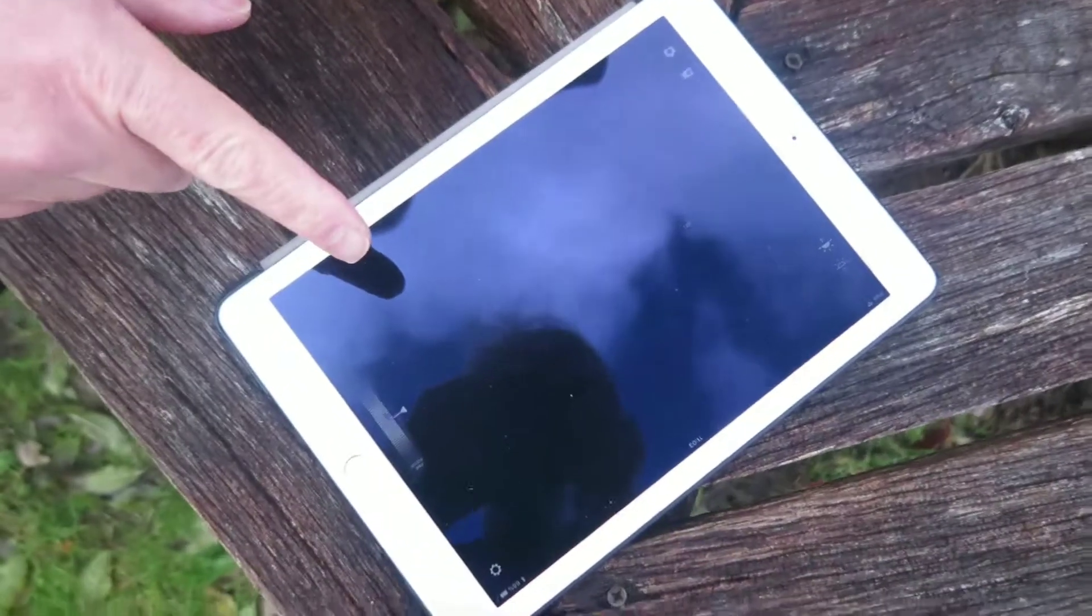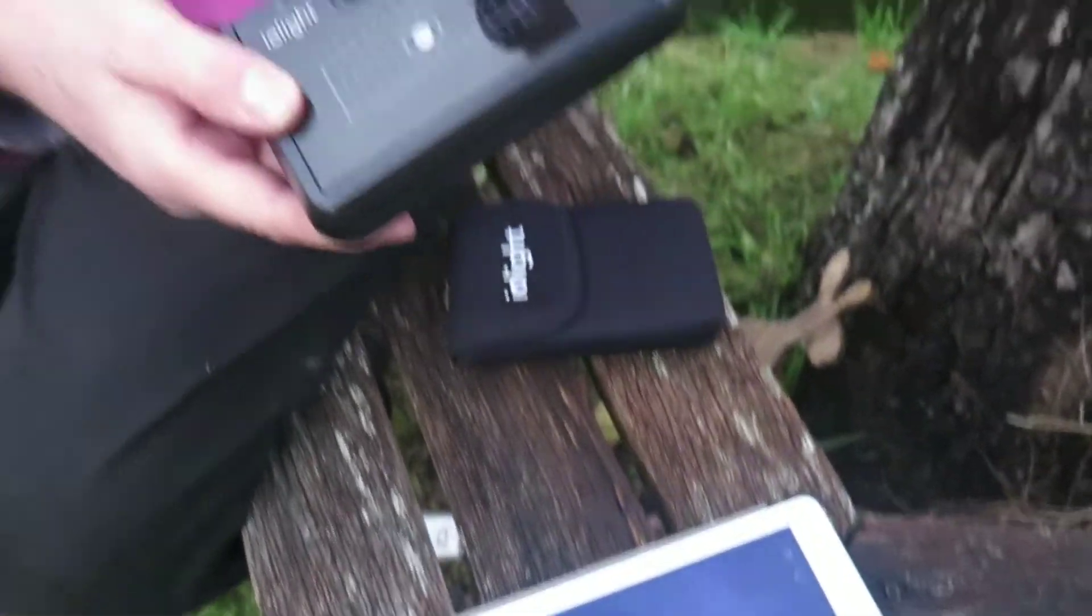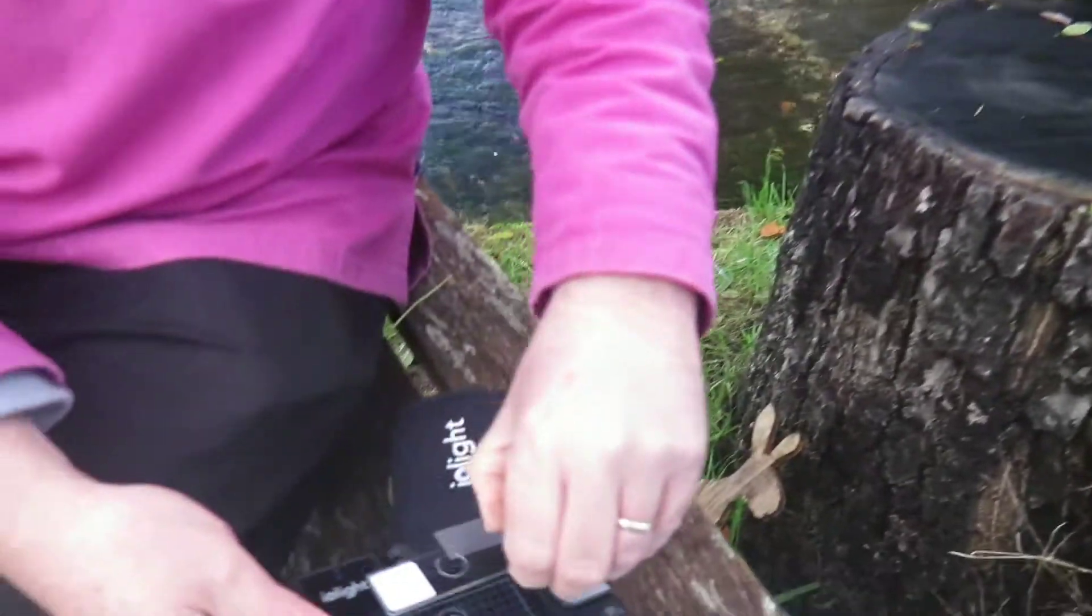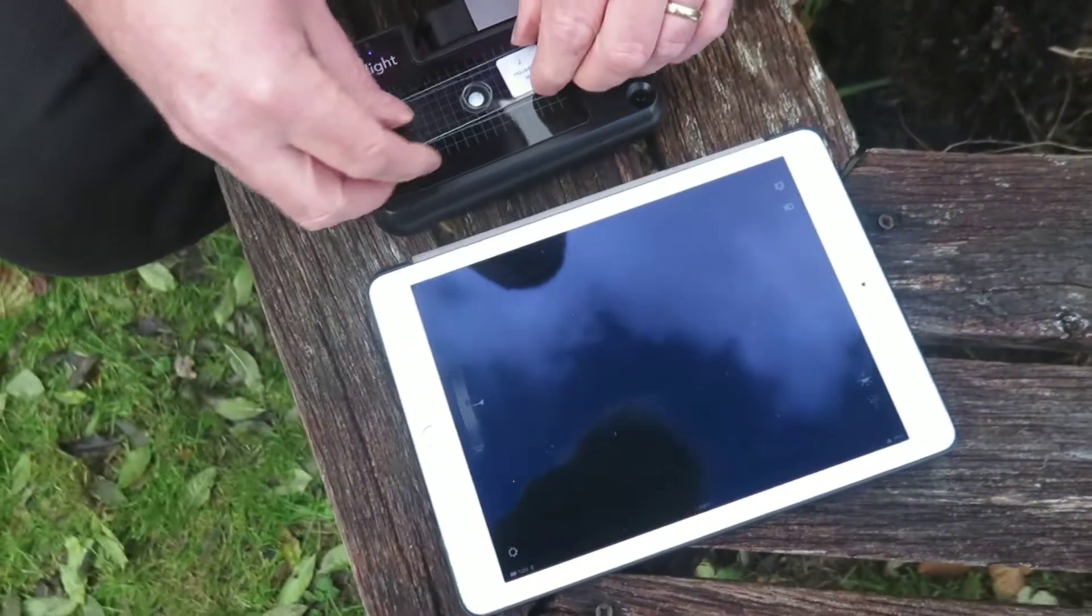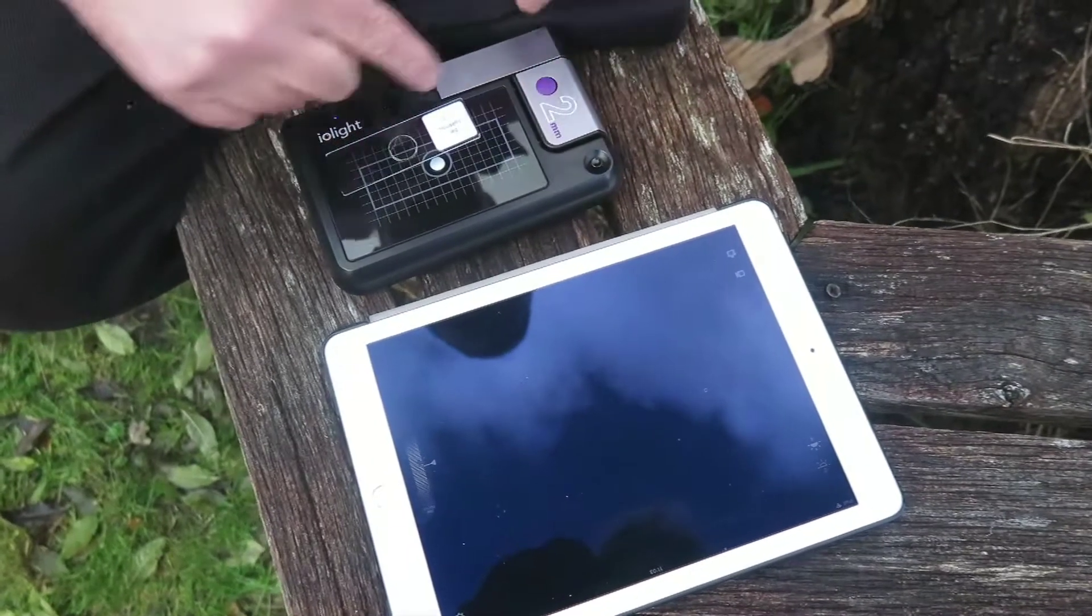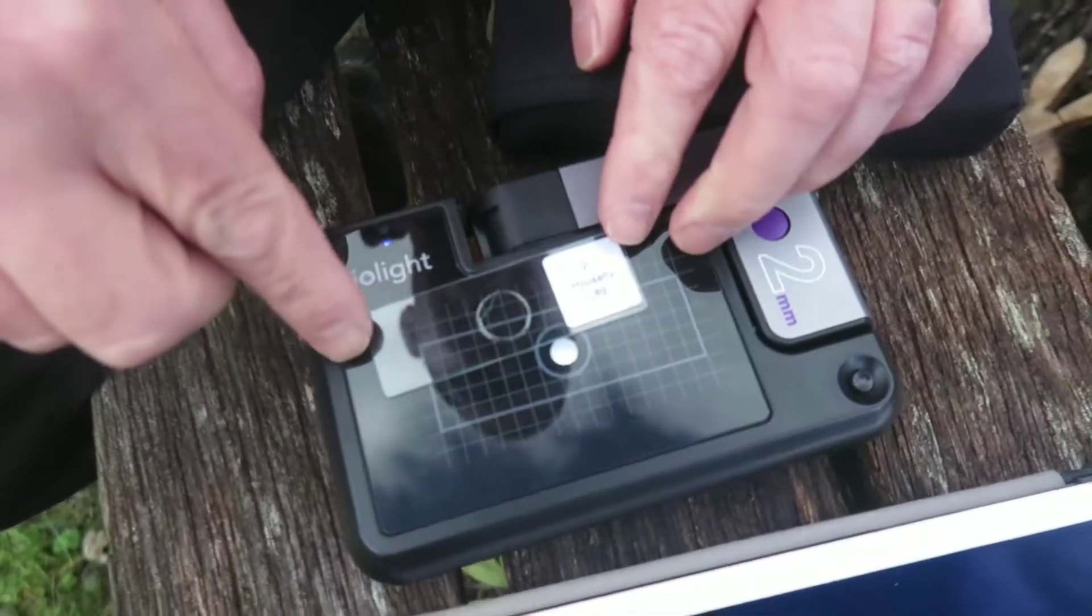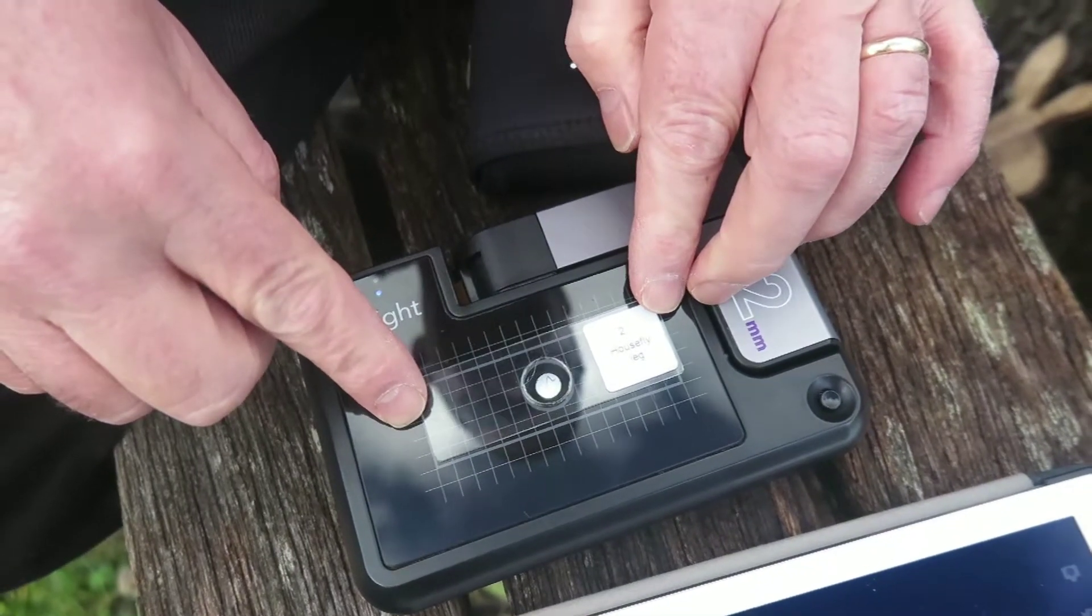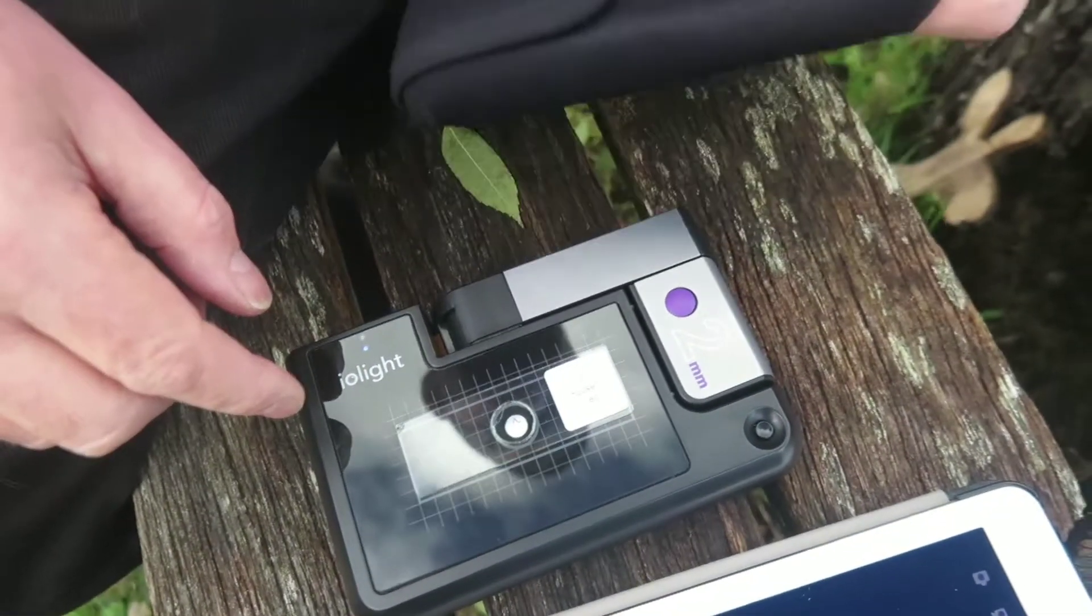This microscope is already coupled to the iPad so now I have to just find a slide. So here's my slide and that is going to go on the stage of the microscope. The microscope has a rectangle drawn on the stage so that it's very easy to tell where you should start. So that's your starting point.